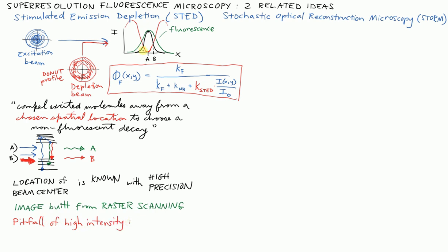Because you might think, as long as I have a true zero here at A, I want to crank this red beam up as strongly as possible to make almost very close B locations still be strongly stimulated down to emit red photons rather than green ones.